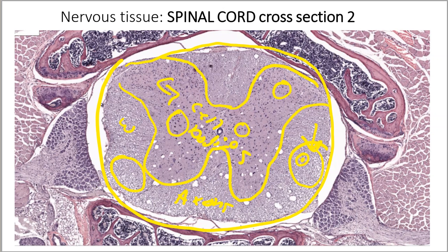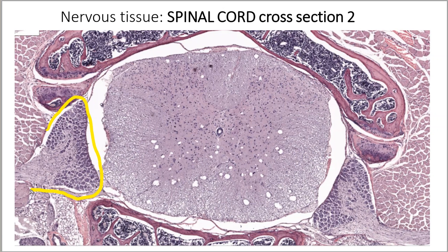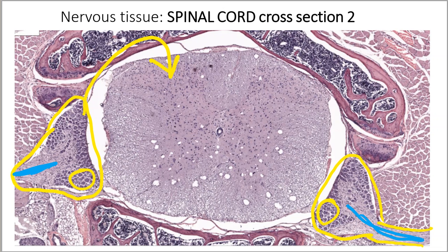We're going to see that in the dorsal root ganglion too, right? This is what the dorsal root ganglion looks like on this slide. Here you can see the spinal nerve exiting, and then here we have a bunch of cell bodies right there, and then axons right there. Axons right here, cell bodies right there. It would go up and hook into the dorsal horn of your gray matter. We'll learn more about that next week. I just wanted to show you so that when you looked at this slide, you knew what the dorsal horn was on this slide.